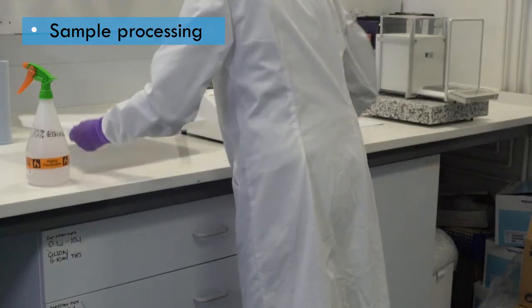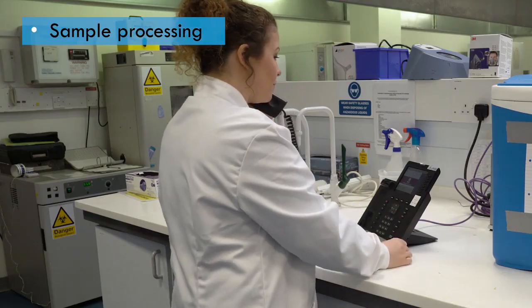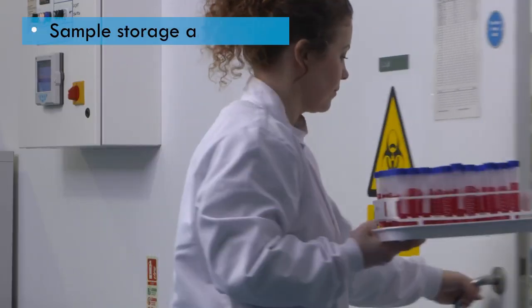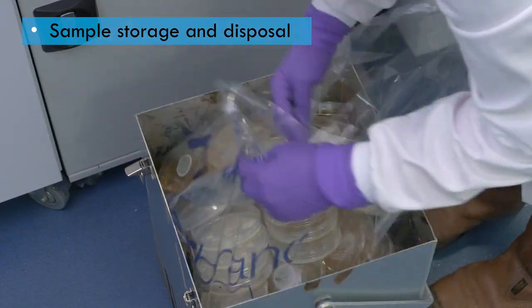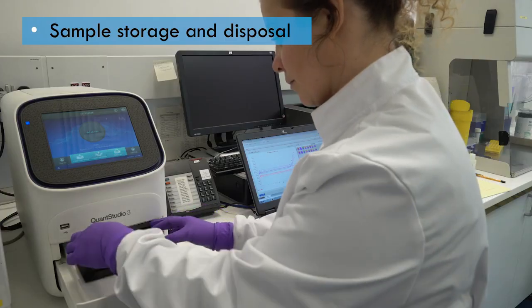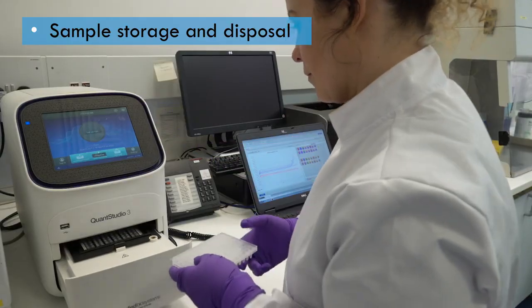To avoid confusion and misplaced samples, clear communication with colleagues will be required before sending the sample to a different department. Some samples may require storage after processing. Some may go straight to waste disposal. And some may be destroyed during sample processing, for example, DNA extraction for molecular analysis.